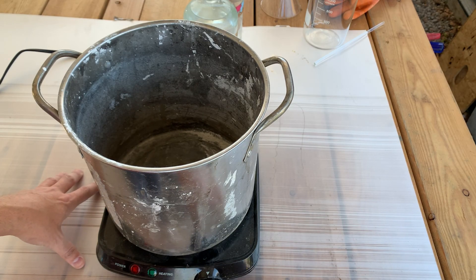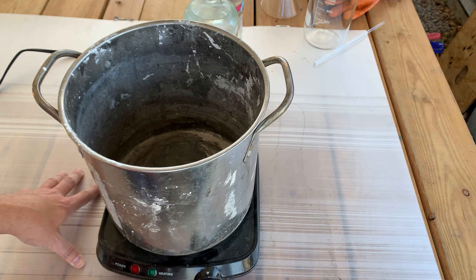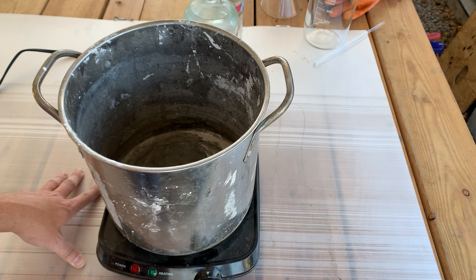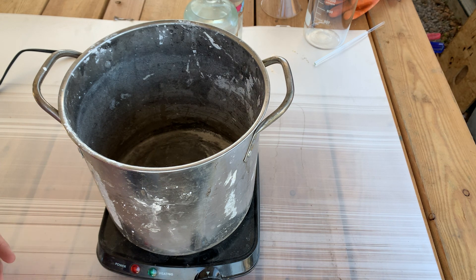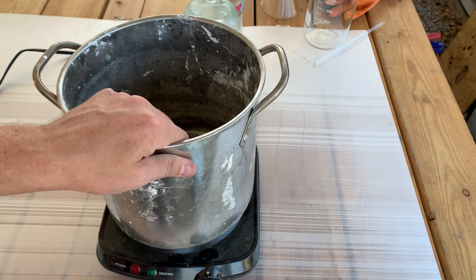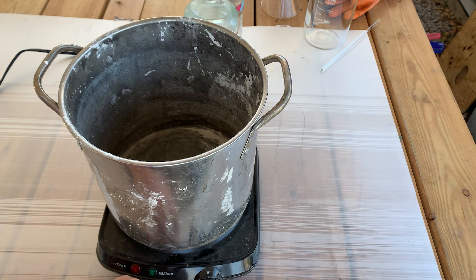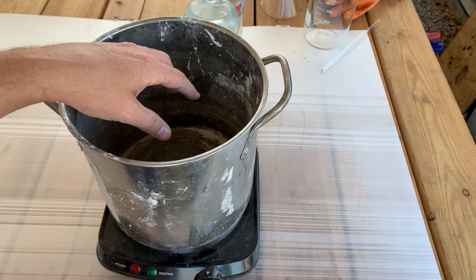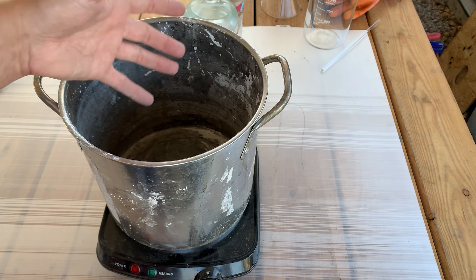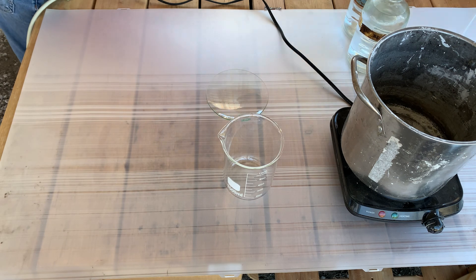Here you can see that I've got the film from that TV we tore apart last week. It's going to help me protect my bench from sulfuric acid — sulfuric will burn your bench, not catch it on fire, but it'll stain it black and make it start to change a little bit. So we want to protect the bench the best we can, so the film is down. Also, if the reaction gets out of control, this pot will help catch it.